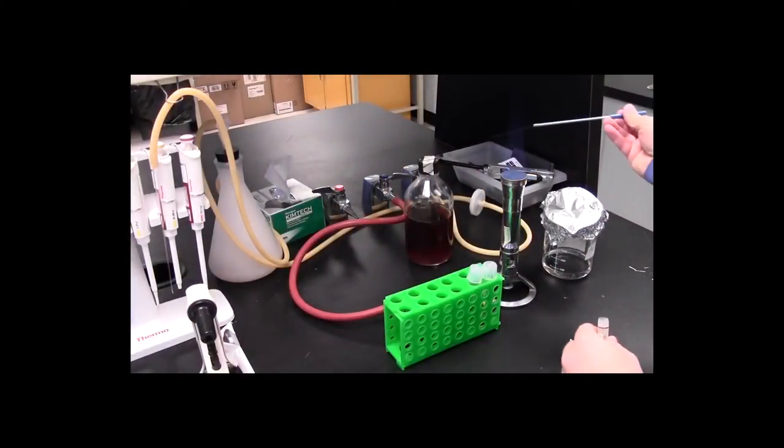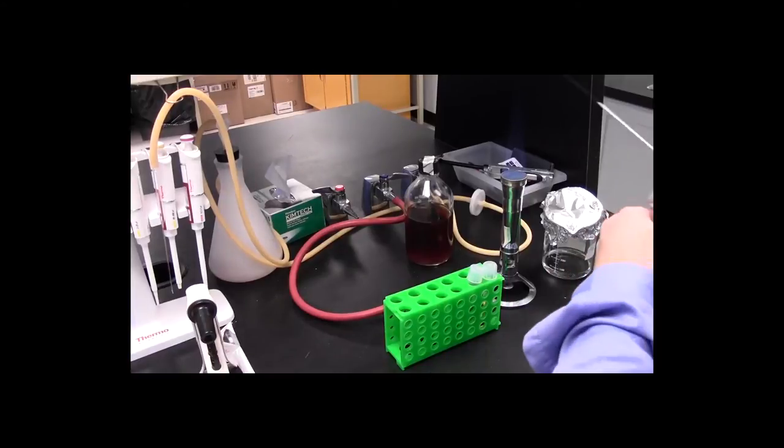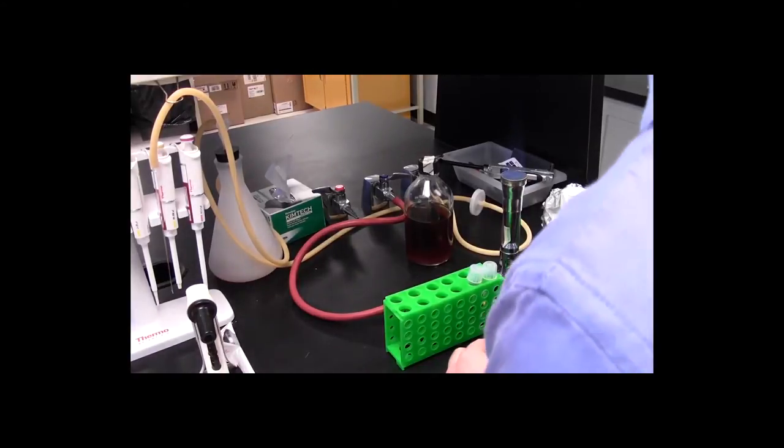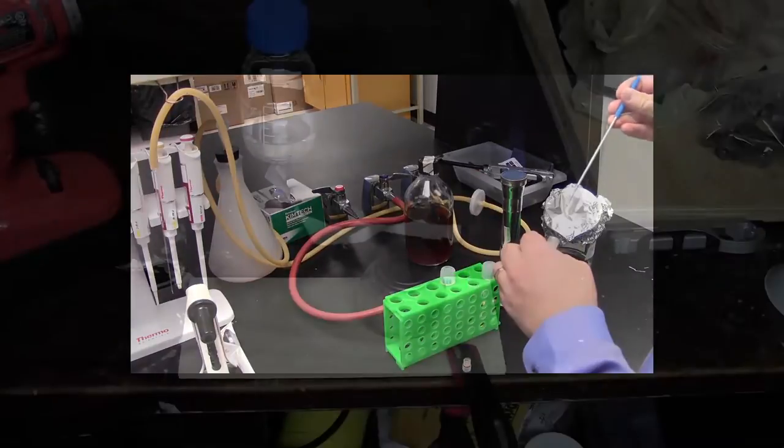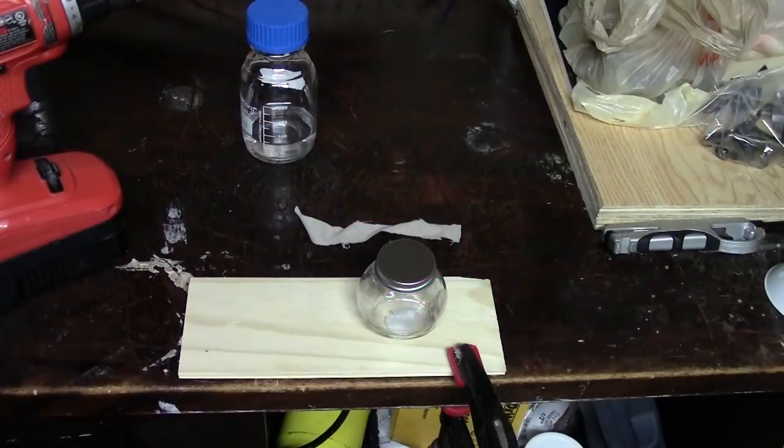In the lab, we traditionally use a Bunsen burner, but of course these are somewhat expensive and can be a little dangerous to use around the house. A cheap option that you can make often just with scrap materials lying around the house is something called an alcohol lamp.